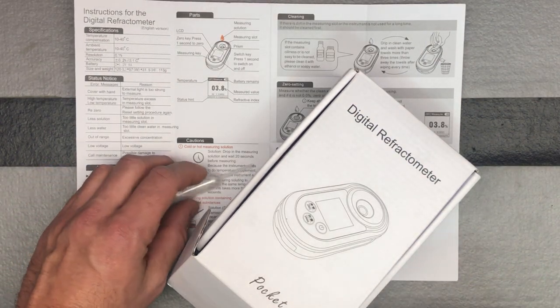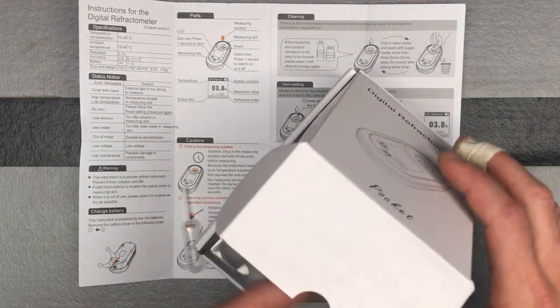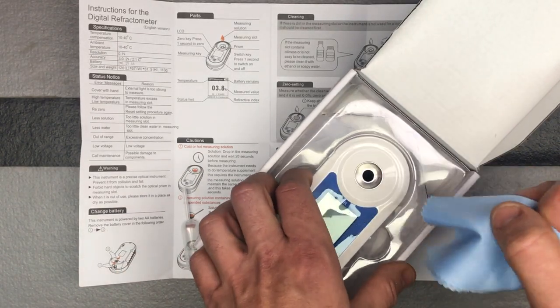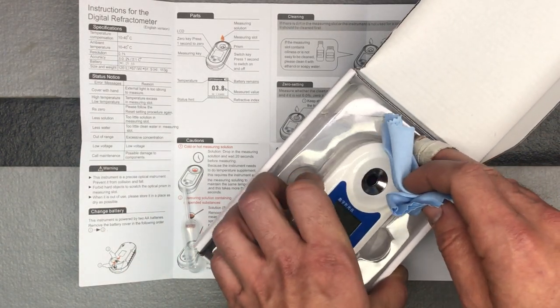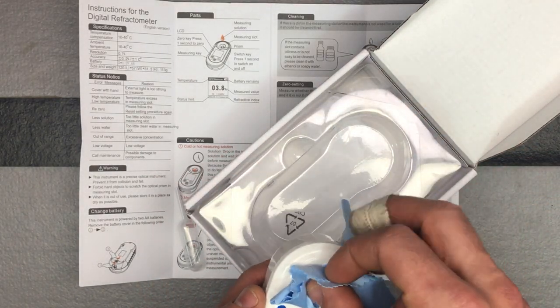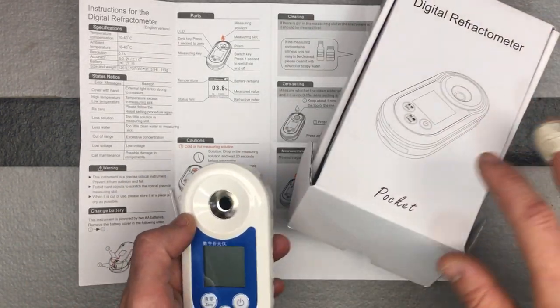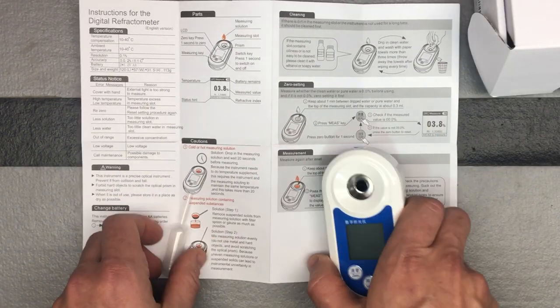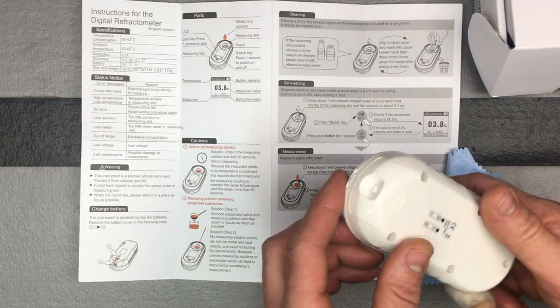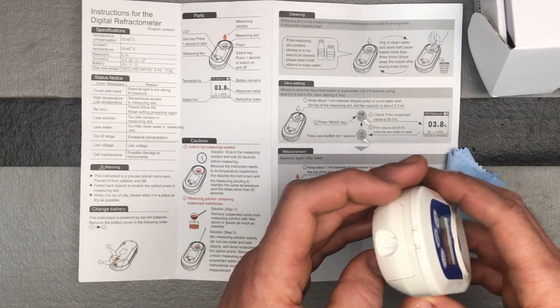There are certainly some people out there who really can't have sugar, and that's where something like this would really come in handy. It comes with a little cloth because the area where you drip the liquid needs to be kept dry — that's where it actually does the measurement. It also comes with a little dropper. This runs on two double-A batteries.